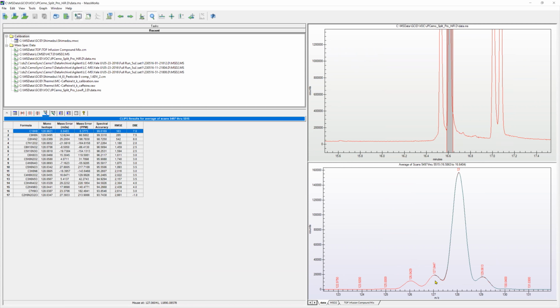Yeah. The software would allow you to do that, except that you also have to start the spectral accuracy mass window a little further to the left, to -2 or -2.5, to include that -2H peak into consideration, which will allow the fitting curve to cover it. That's actually shown right here, I think is what he's talking about.